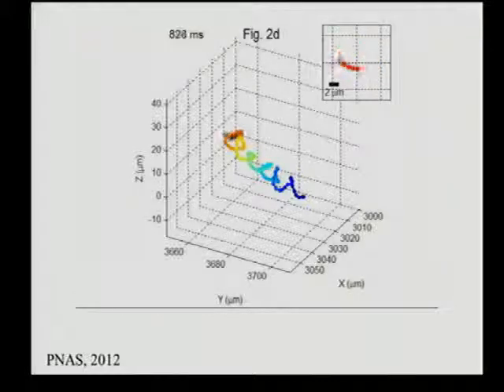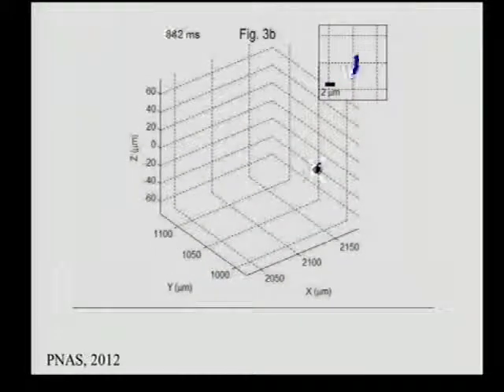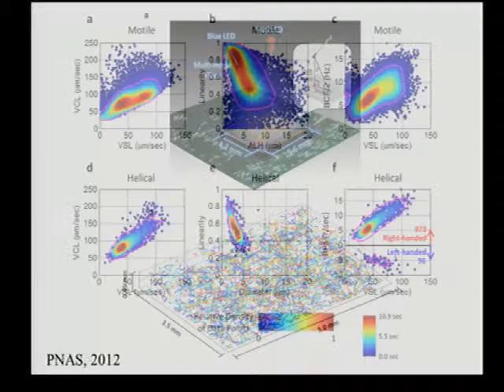It has more energy. It's slightly irregular, but still a nice, beautiful helix. This platform can look at not just a few, but 1,000 or 2,000 sperms in parallel and record, at the end of the day, holograms that you can process to create trajectories, thousands of them. And you're looking at a crowded scene like this, where in this case there are about 1,500 of them, tracked across 11 seconds. And you can generate many of these across a few hours of an experiment.